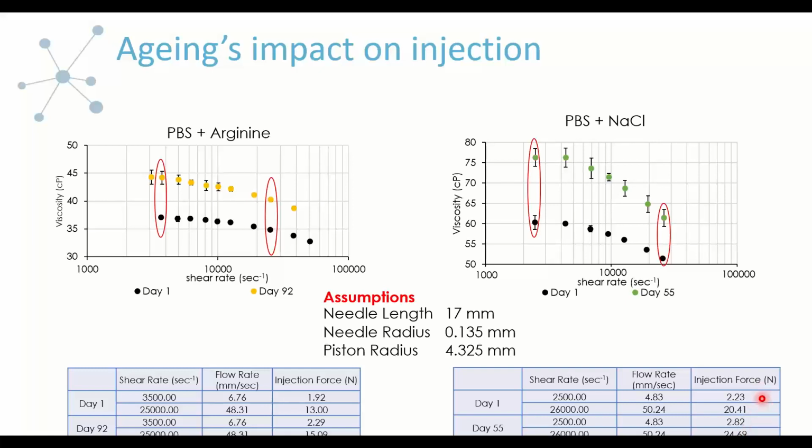This is a 26.5% increase in injection force, and this is a 21% increase in injection force over the course of 55 days. So they had a larger increase in injection force over a shorter period of time. The way these aged was dramatically different.